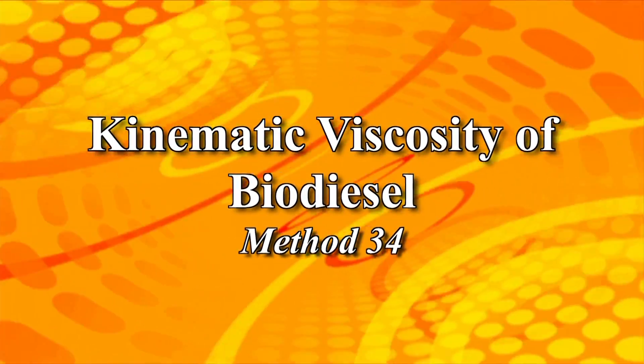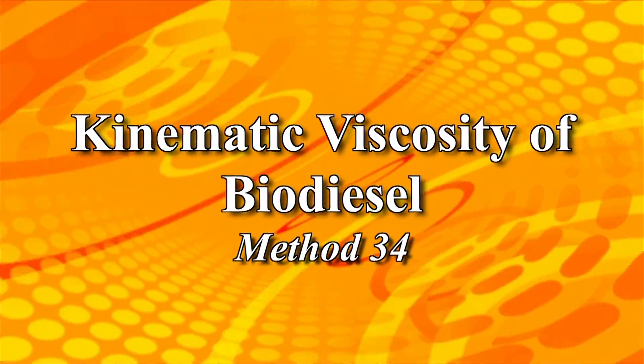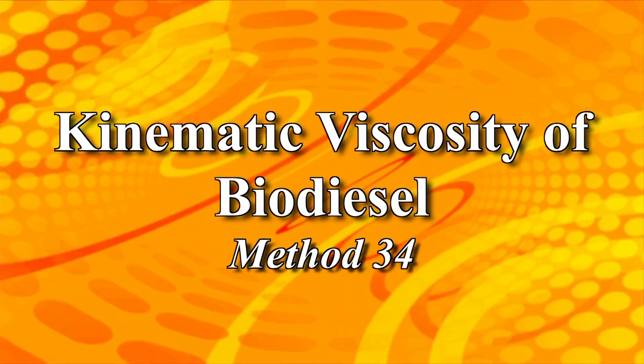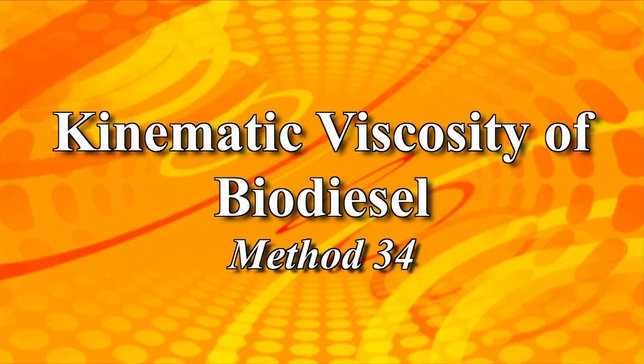This is the video presentation for the determination of kinematic viscosity of biodiesel, Analytical Services Method 34.